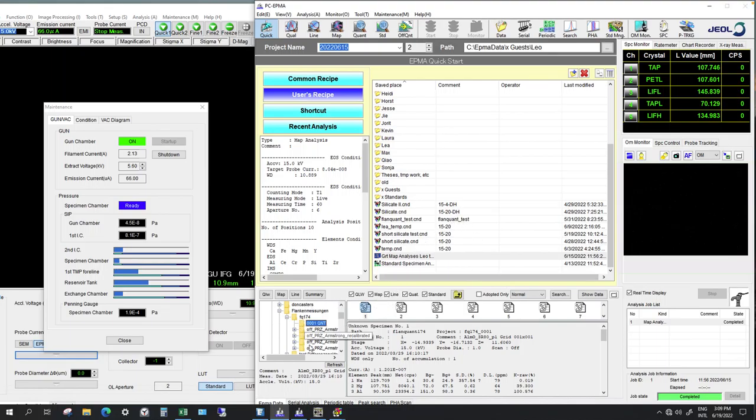On the microprobe, first navigate to the file you're looking for. I already did this because it takes quite a while until all the individual files are loaded.